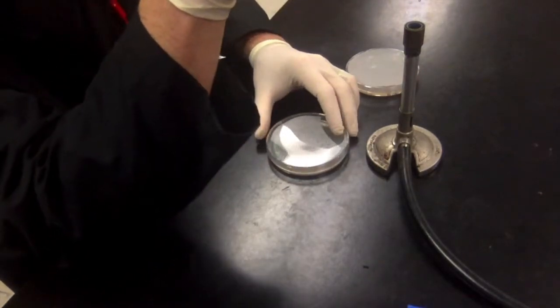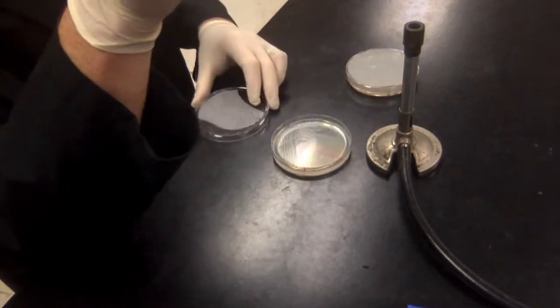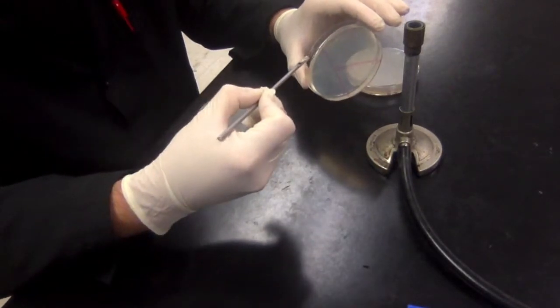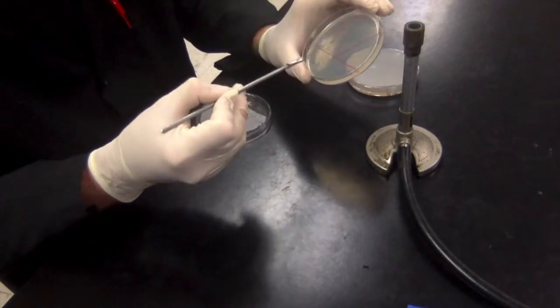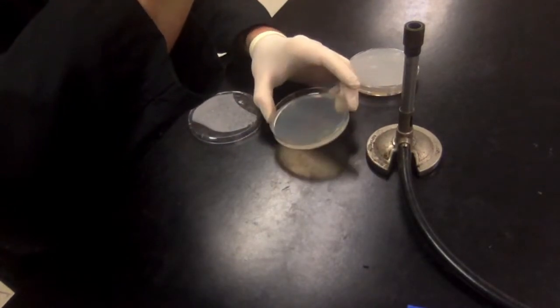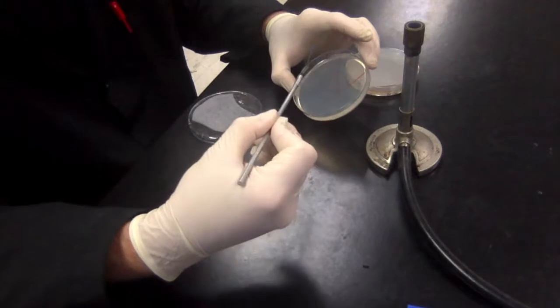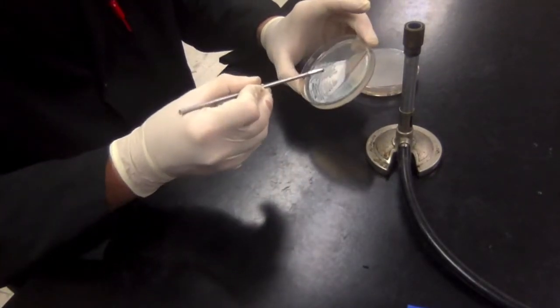I'm going to repeat that process, moving clockwise around the plate to the other sectors. This whole time I'm holding the plate within the protection zone created by the Bunsen burner.